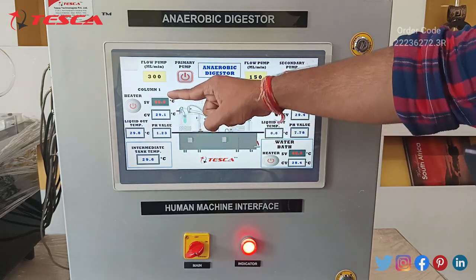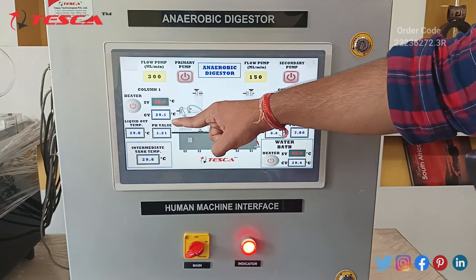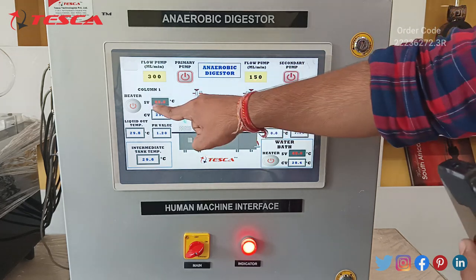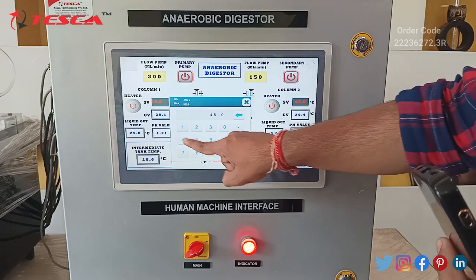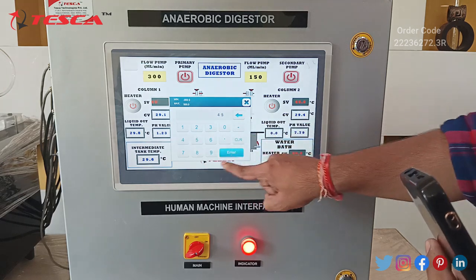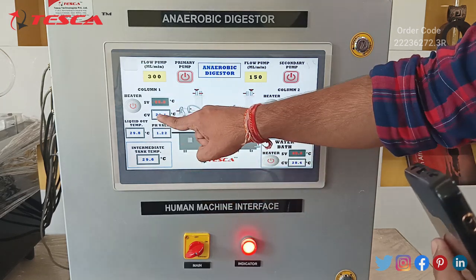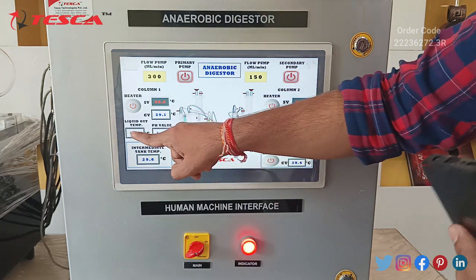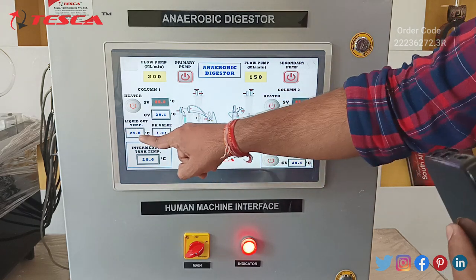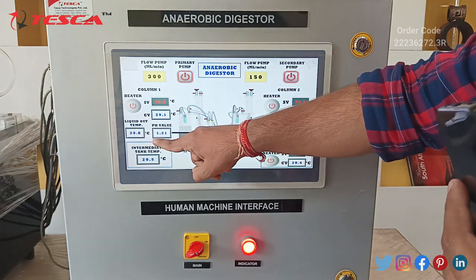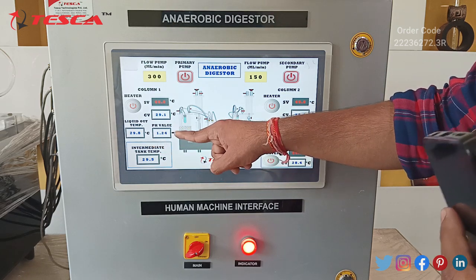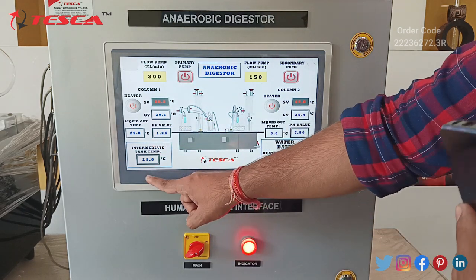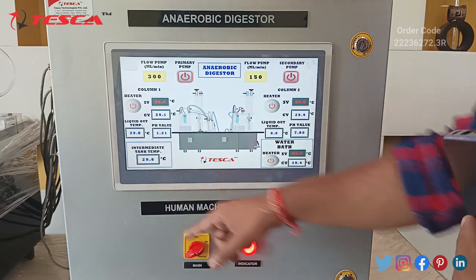As you can see in column 1, we have our set value temperature and current value temperature in degrees Celsius. We can set the temperature value — for example, let us set it at 45 degrees Celsius. The current value of temperature is 29.1, and we can also measure liquid out temperature of column 1 and pH value of column 1. Here we have our temperature measurement of the intermediate tank.